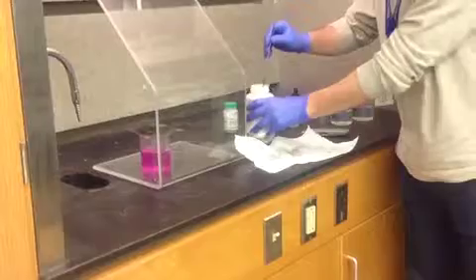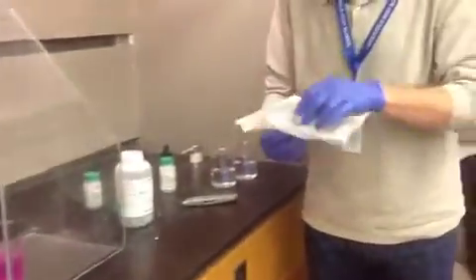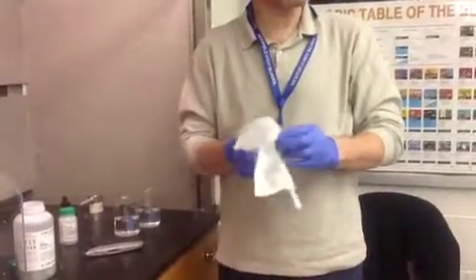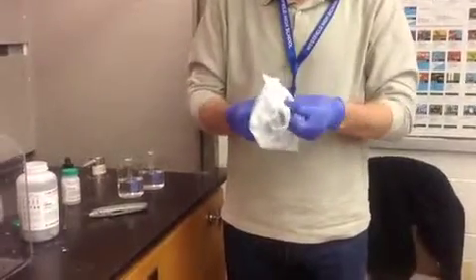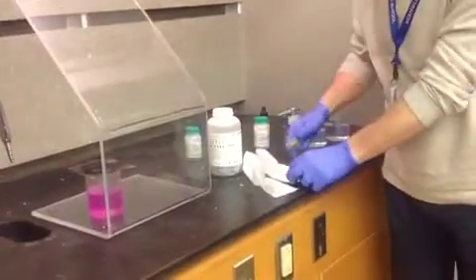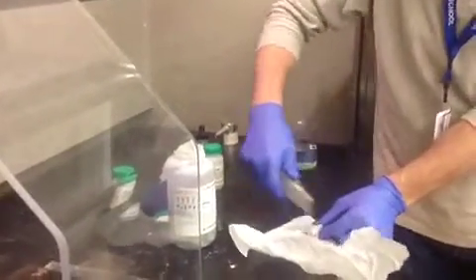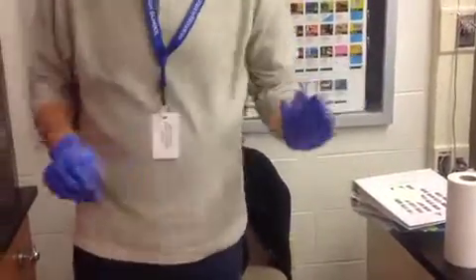Sodium, these are nicer chunks. I like the sodium. Sodium also has this dull appearance. Sodium is a lot easier to cut, though, because the electrons are holding the sodium together a lot less strongly, and we'll talk about the bonds that hold metals together in Chapter 8. It turns out that it's a lot easier to cut the sodium open, and so I can cut off the corner. It's like cutting cold butter. And again, we get that nice shiny surface on the inside.